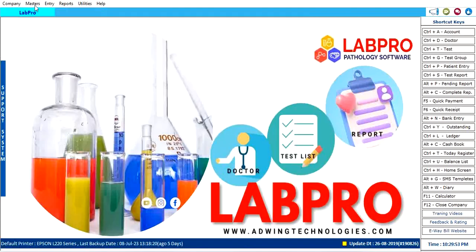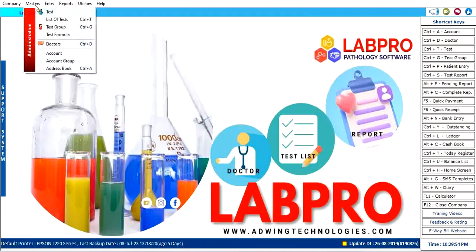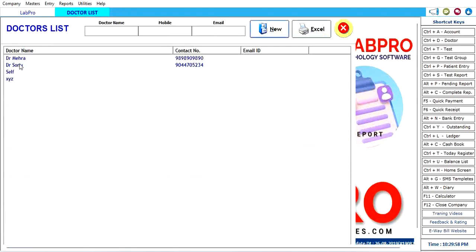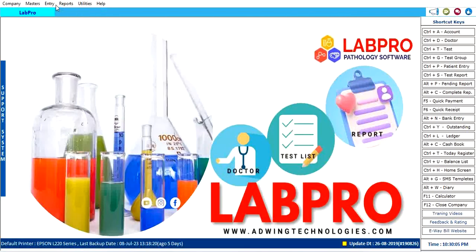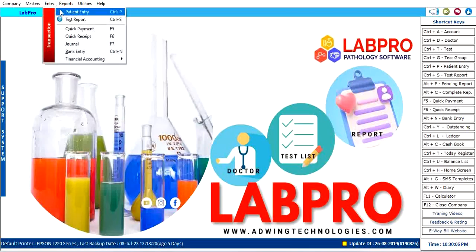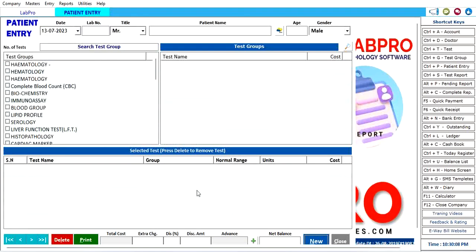You can also add doctors for referral sharing. Just put the doctor name, mobile number, email, and add it here. Apart from that, input the entry.